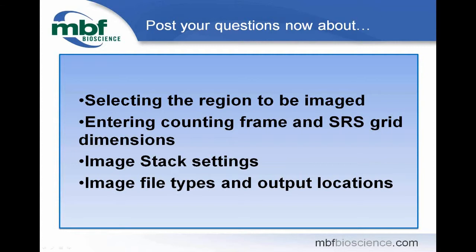This essentially means that you want to count all of the BrdU positive labeled cells in this one region of interest. To that end, the exhaustive grid option makes it such that the entire area of your entire contour region of interest is imaged. In the end, when you do your analyses, you will be counting all of the low frequency events in each of your sections. Whereas it sounds like you may not be doing actual data estimation because you're counting every object, it's important to remember that you're counting every object on only those tissue sections which you are sampling.